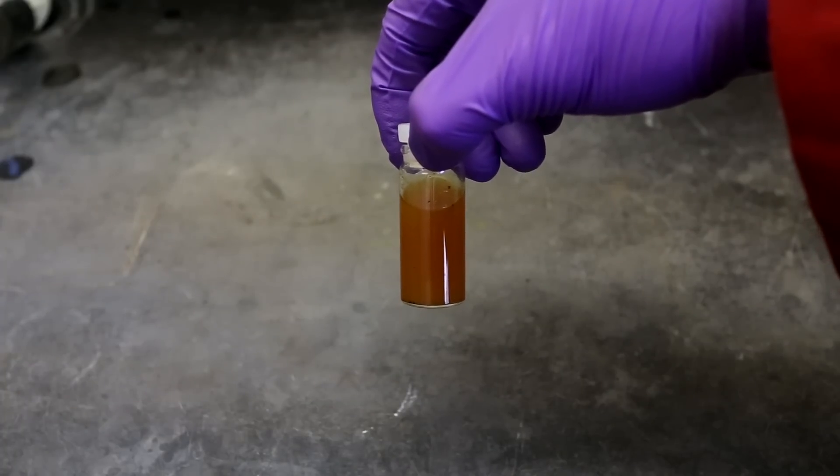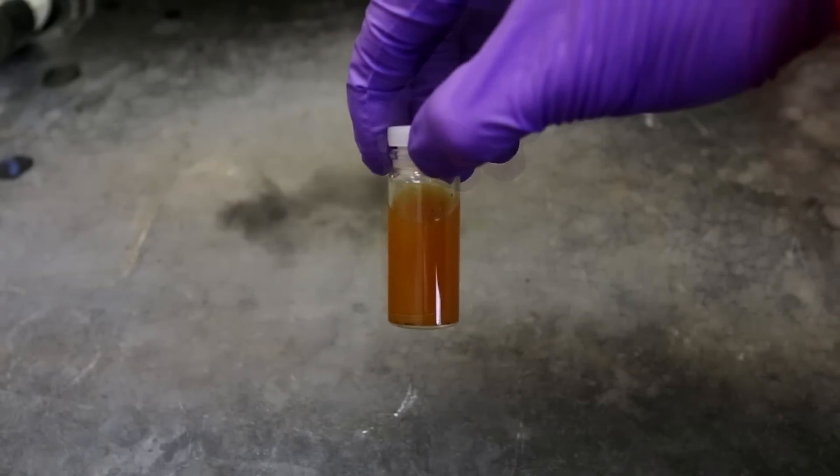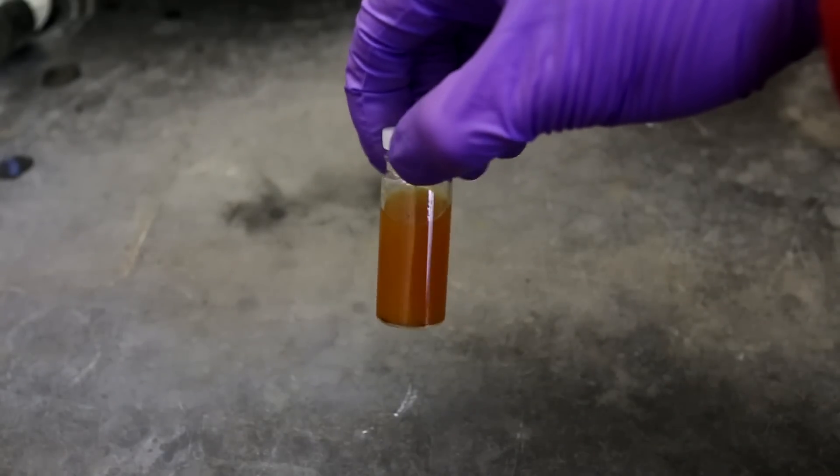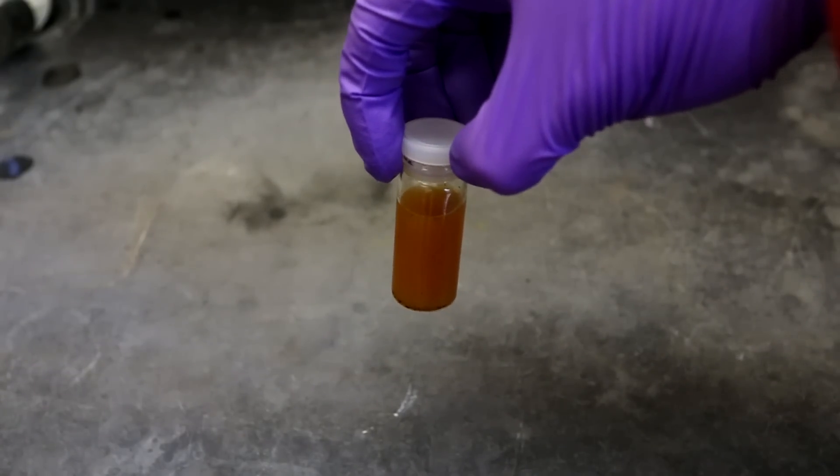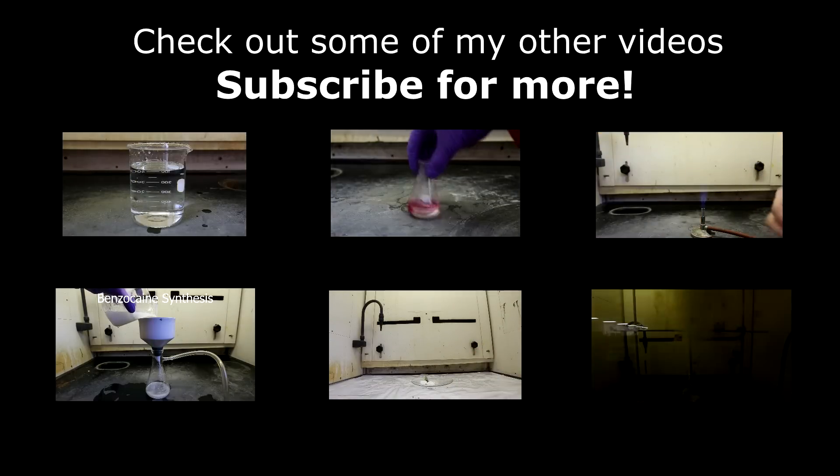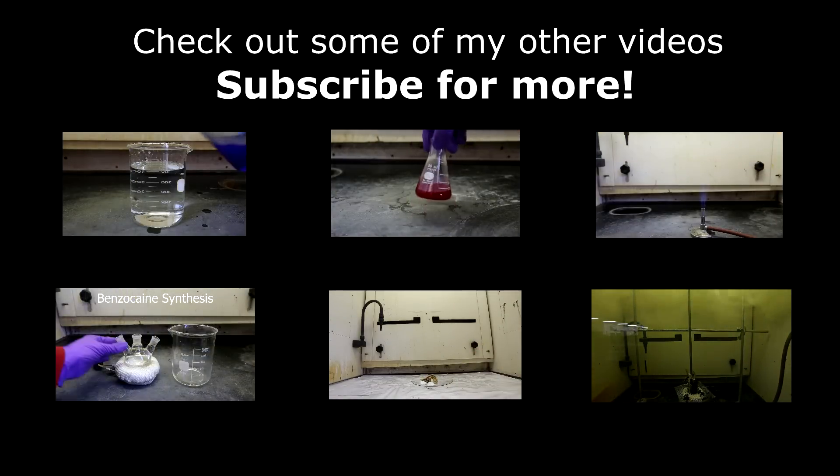The odor of the cadaverine solution in the dram vial was nonetheless quite horrible. If you wish, you can concentrate the cadaverine using diethyl ether to extract it. However, I chose not to proceed any further.